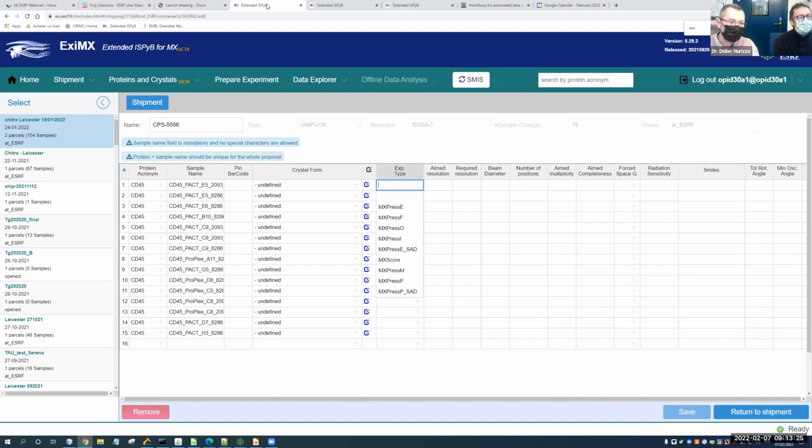Also the size of the beam according to the size of the crystal, tailoring, etc. All the others, except if we're talking about the SAD, are kind of a bit of a shortcut of some of them, which means that some of the steps in the M-Express E are jumped over because we don't want to use them. Some people like that.